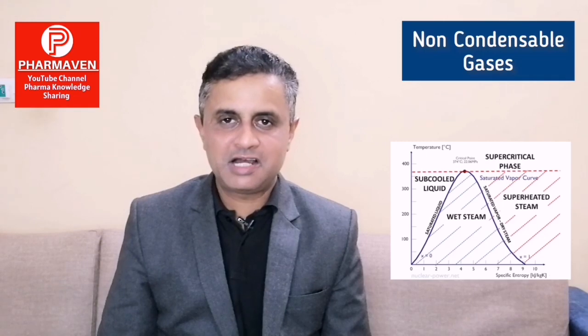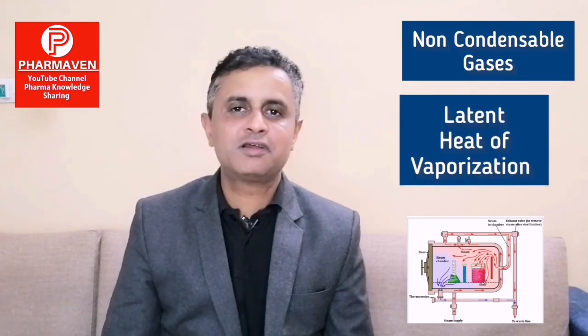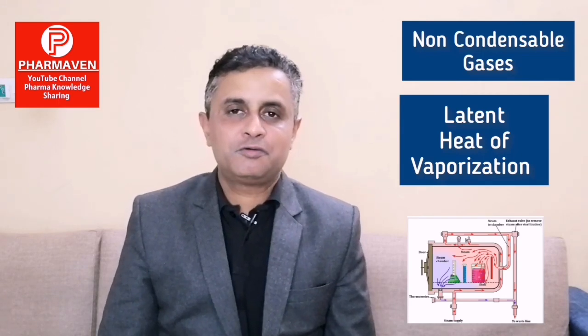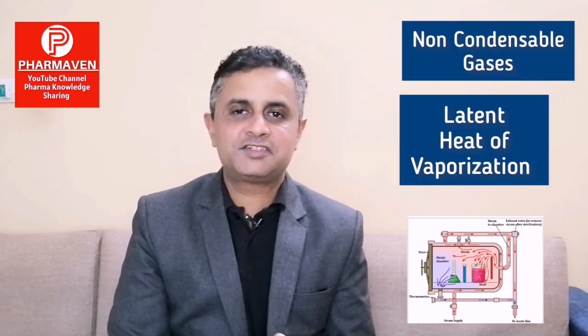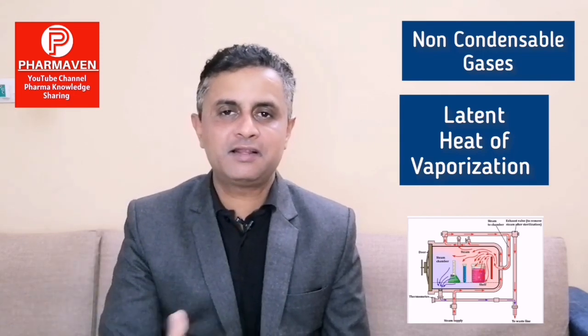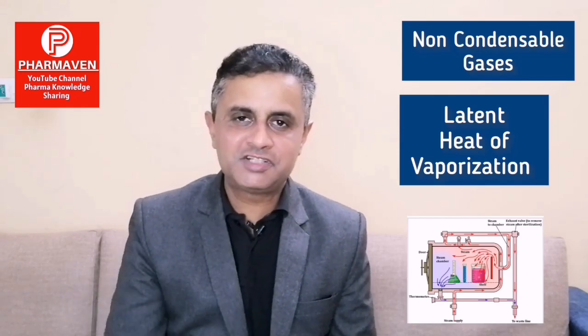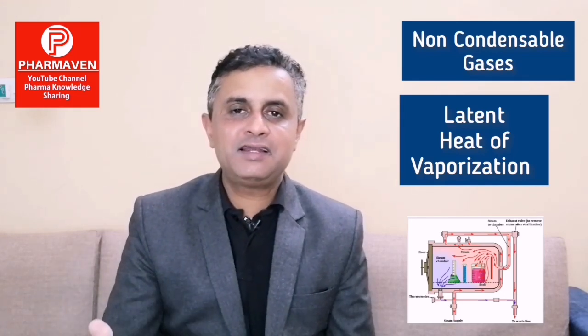So what are the acceptance criteria? Let's start with non-condensable gases. What are non-condensable gases in steam? Before that, we must understand how steam kills microorganisms. When we heat water, it converts to steam. The amount of heat required to convert water into steam is called the latent heat of vaporization. When steam condenses in the chamber onto the load, the energy which was utilized in converting the water to steam is now transferred from the steam to the load items. So steam condenses onto the load item in the autoclave chamber and transfers that heat to the load. That way it increases the load temperature, and that way it kills the bacteria.